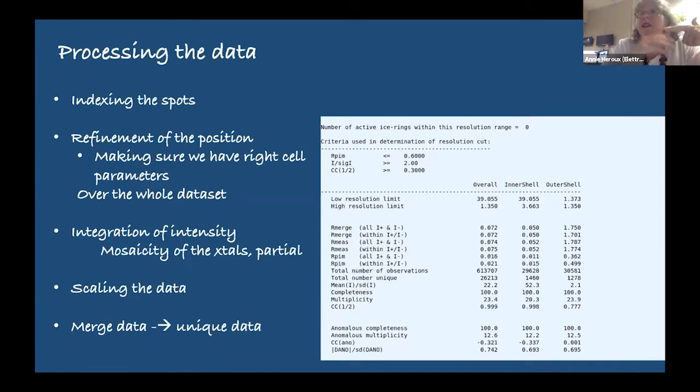It's absolutely normal to have anisotropic diffraction. It will diffract very well in one orientation, and when you get 90 degrees away, the diffraction limit shrinks and then goes back up. So we need to scale these intensities and merge the data. This is the first step in a pipeline of software that we need to use to get to the structure.